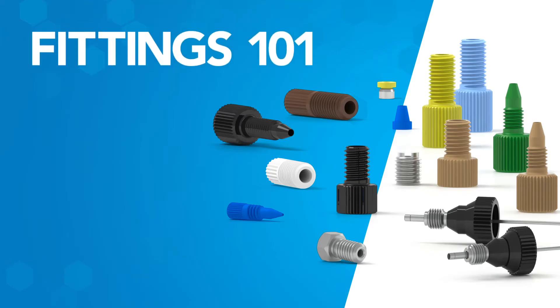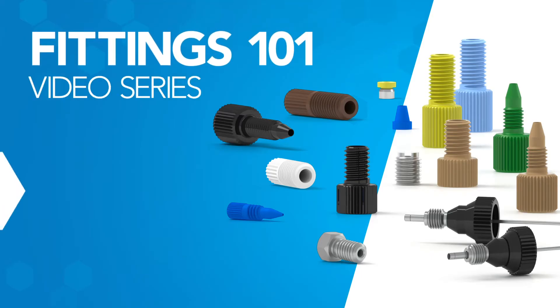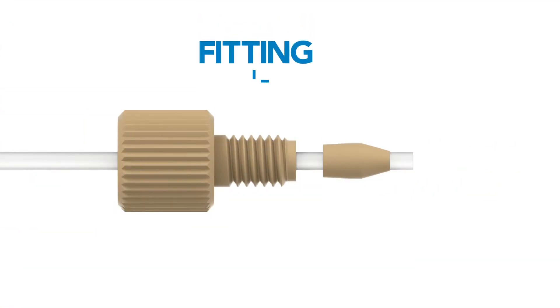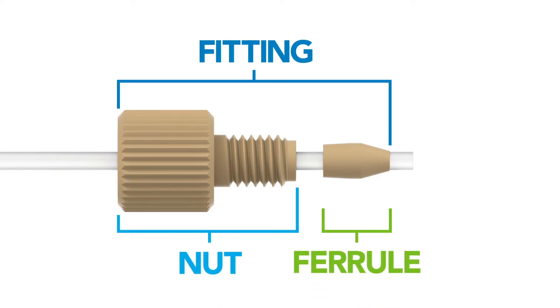Welcome to part two of the Fittings 101 video series: nuts. A fitting in analytical instrumentation refers to a system comprised of a nut and a ferrule.